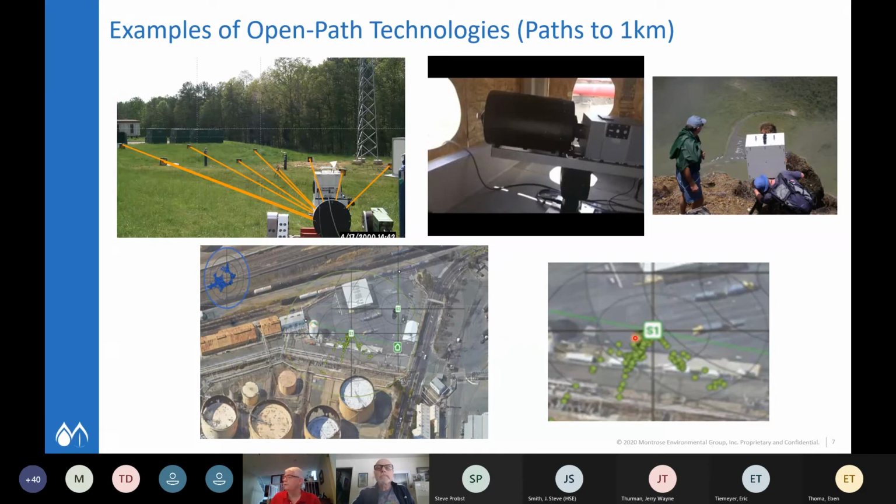So if you look at this, you can see all these green dots, and these are actually hits for ethanol. This was a loading rack where they brought in ethanol to mix into the actual gasoline system. So we did trace back by using some of the algorithm software and a lot of the data points. We did trace back to, and you can kind of see in this picture, there's the trucks there. These were actually when they unloaded the hoses and took the hoses out of the vehicle and had them open is when we saw the biggest spikes in the data.